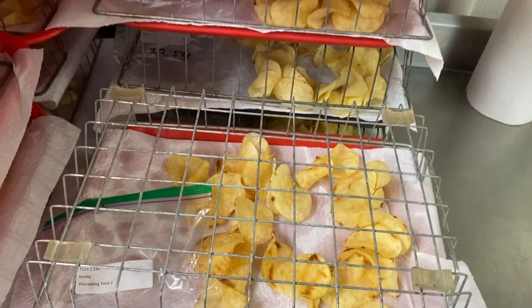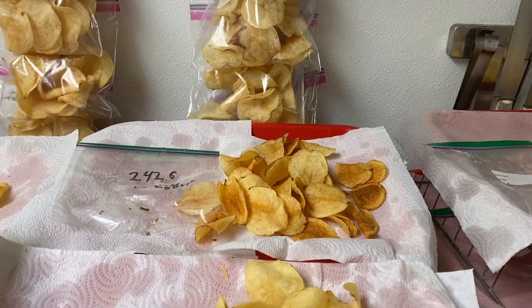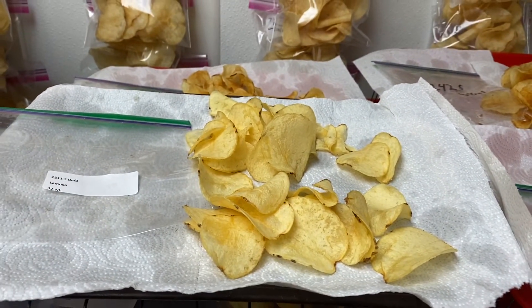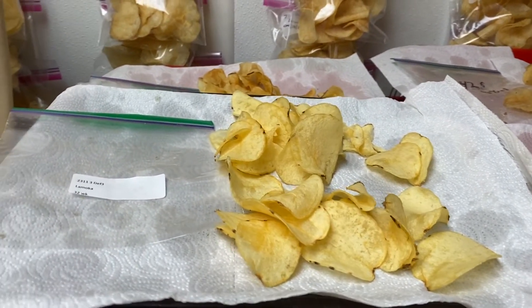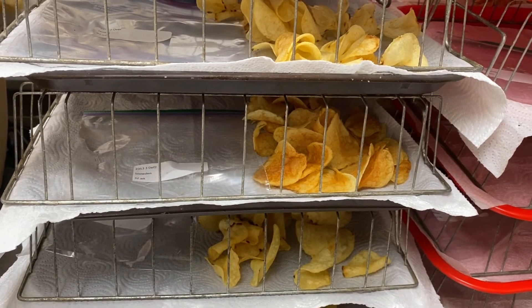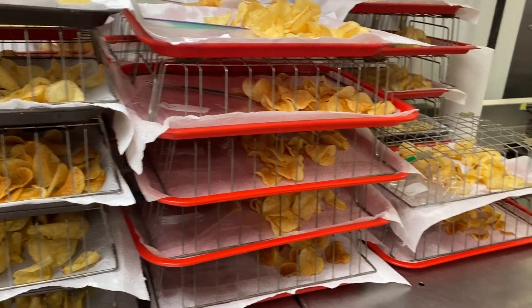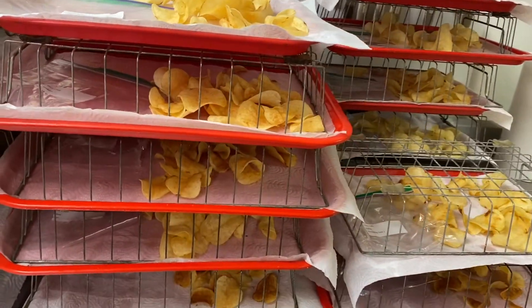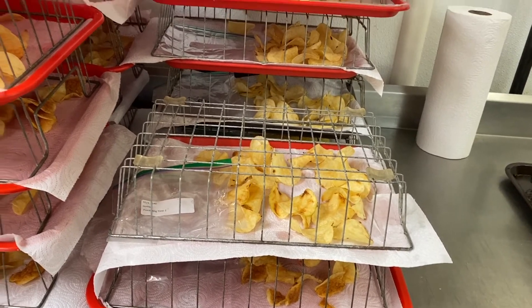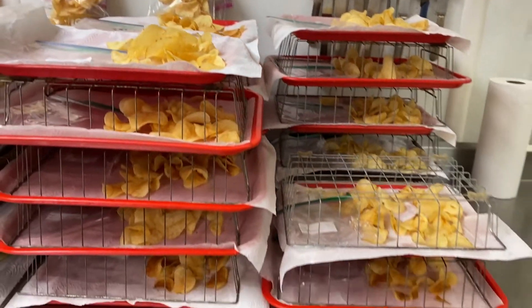By looking at the different chip colors, we should be able to associate this quality with different in-season treatments. In this study, it's the irrigation — we have different levels of irrigation: one is over-irrigation and the others are deficit irrigation. We are trying to evaluate what are the impacts of those irrigation treatments during the growing season on the post-harvest storage quality. As I mentioned, these tubers have been stored for eight months, so that's a long-term storage season.